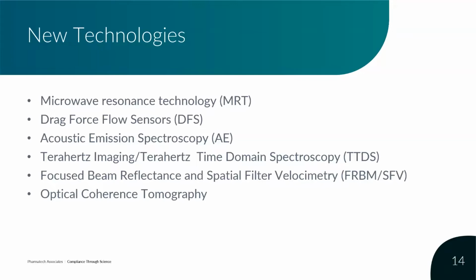Terahertz pulsed imaging and terahertz time domain spectroscopy have been shown to be very useful for monitoring the thickness of a film coating, as well as pore size in coated tablets, as well as granules. These techniques use terahertz energy pulses, which I like to think of as far infrared.